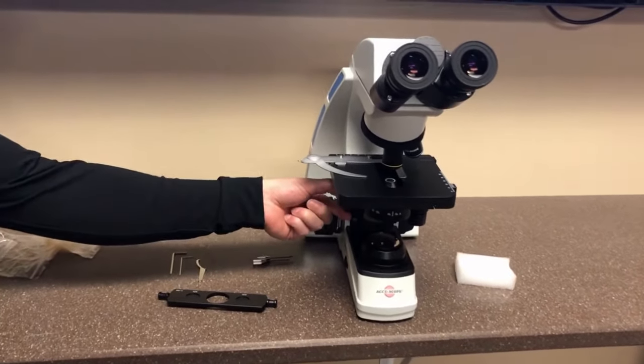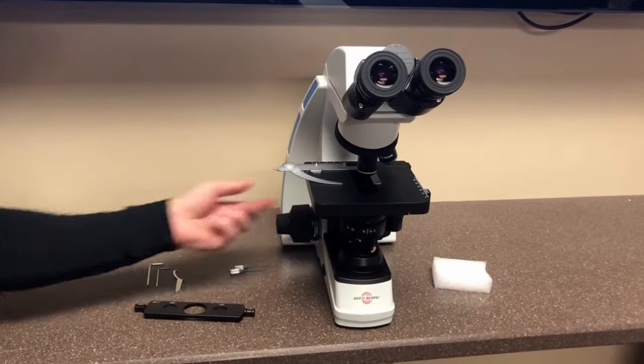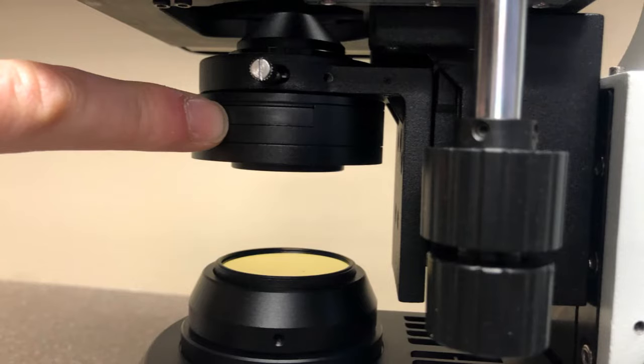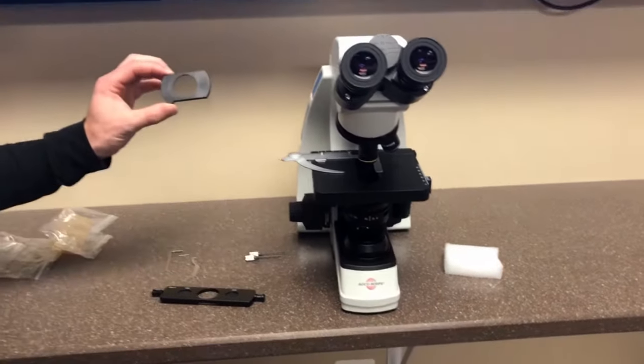Second, lower the condenser with the knob on the left hand side of the microscope by turning it downwards. Third, push the phase slider stop through from the left and remove the plastic piece.